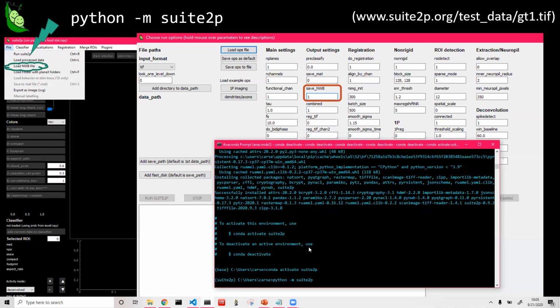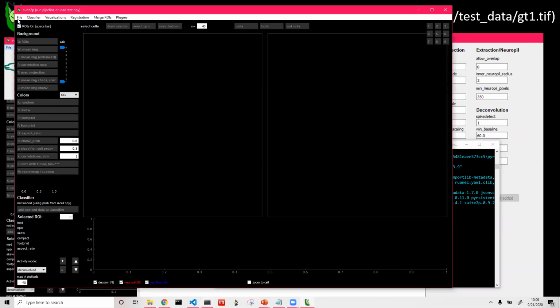Okay, so starting up suite2p. And this will take a second. And now I'm going to do what we were saying, run suite2p.